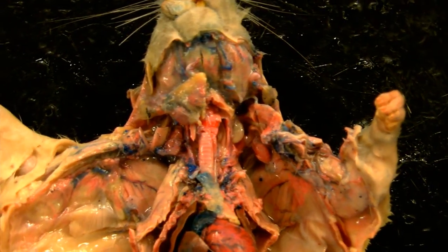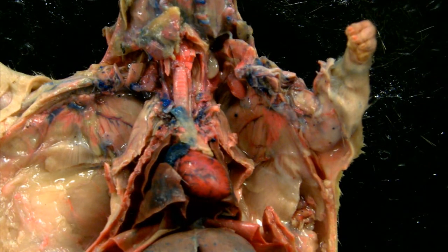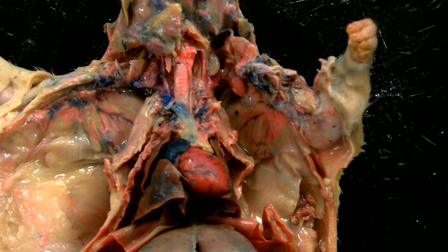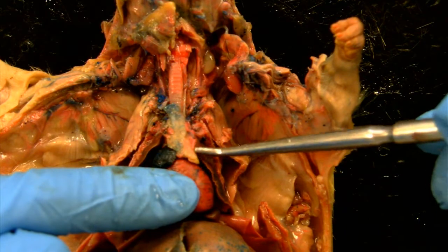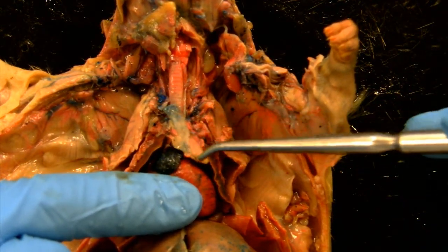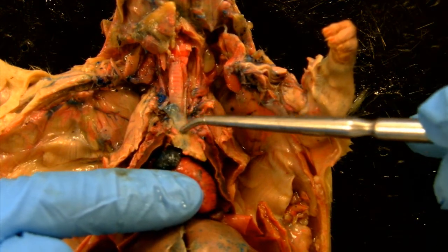Let's work our way down and we now have the heart in focus. There's a gland that is associated with the top of the heart — it's called the thymus. So this tissue here that's a slightly different color, beige-ish, is the thymus gland.